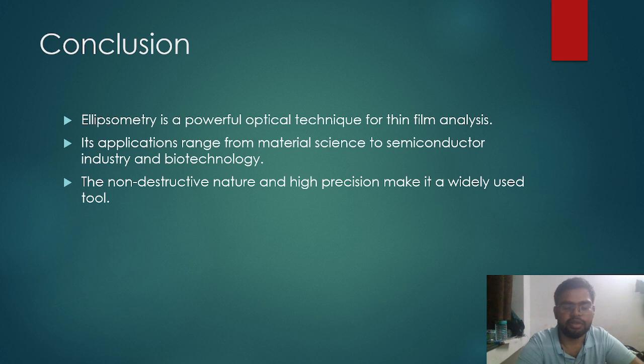So, from this PPT, we can conclude that ellipsometry is a very powerful optical technique which is used for thin film analysis. Its application ranges from material science to semiconductor industries to biotechnology to various other industries. Also, the non-destructive nature and the high precision make it a widely used tool.